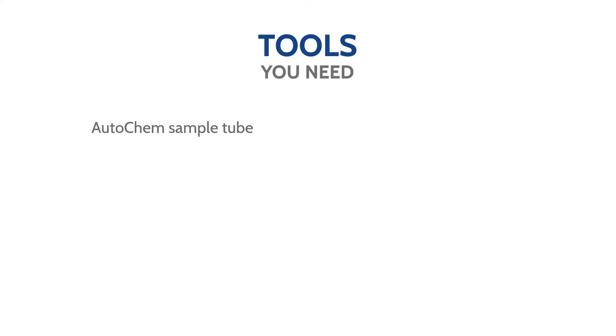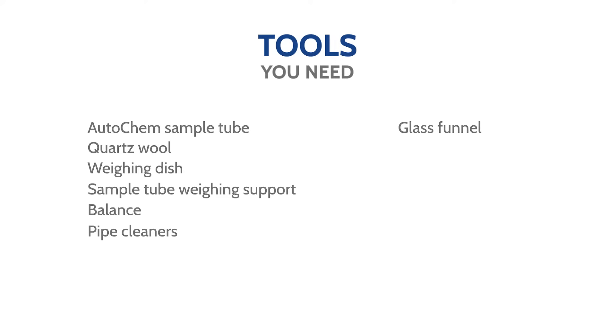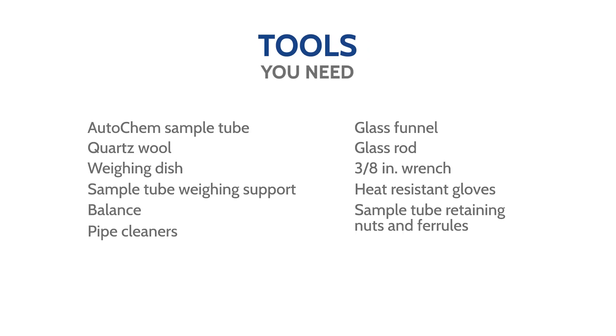The tools and materials you will need for sample preparation are an AutoChem sample tube, quartz wool, a weighing dish, a sample tube weighing support, a balance, pipe cleaners, a glass funnel, a glass rod, a 3/8 inch wrench, a pair of heat-resistant gloves, sample tube retaining nuts and ferrules, and CalRes O-rings size 9 and 13.